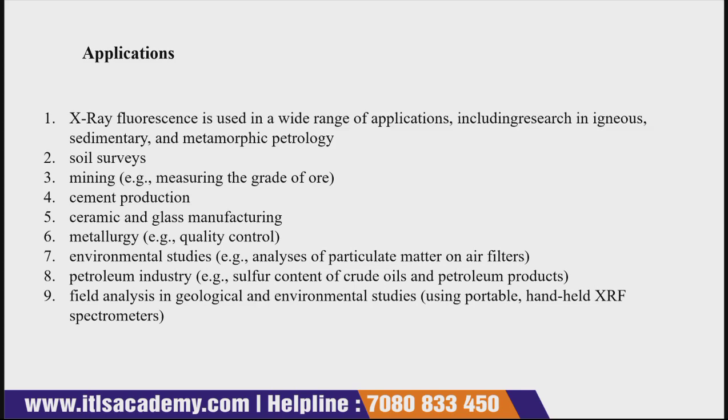Apart from this, it has a huge application in microbiology, where you want to detect different types of microorganisms. So there is a very wide range of applications where X-ray fluorescence spectroscopy is used.